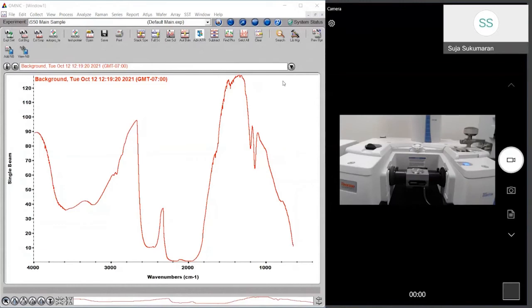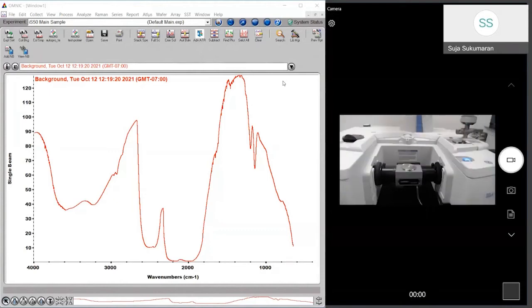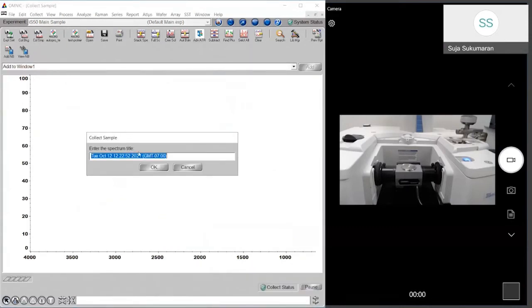So I'm ready for either my sample or the buffer measurements just by itself. All I need is 10 microliters of my buffer or the sample. So here I will go ahead and load 10 microliters of my buffer solution. I just loaded 10 microliters of the buffer solution in there, and I'm ready to start my measurement. All I need to do here is click collect sample, and I'm ready to measure.